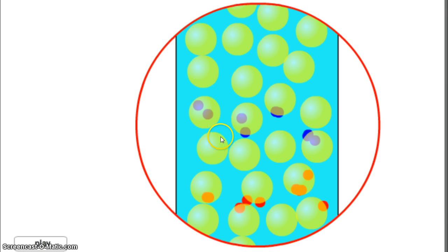And when all the molecules are moving through the mobile phase, they go at the same speed. Basically, this is the different degrees of retention in the stationary phase, and that's the essence of selectivity.